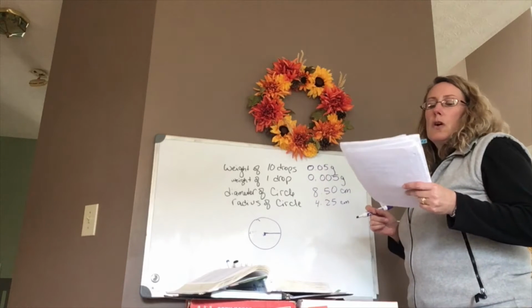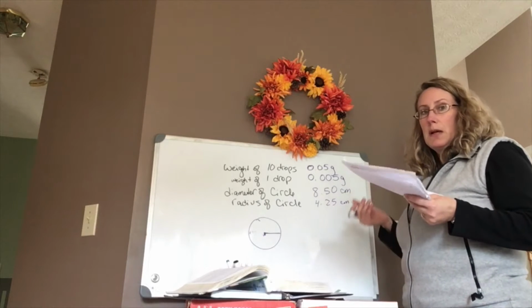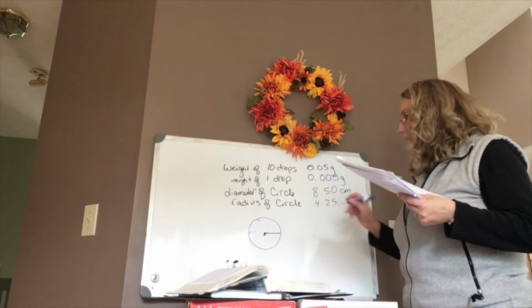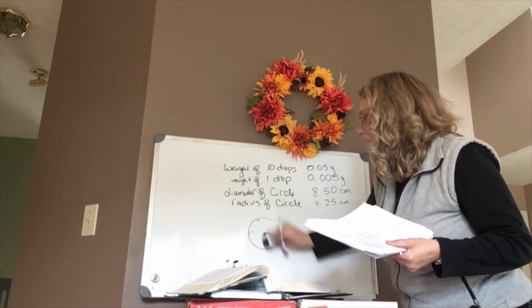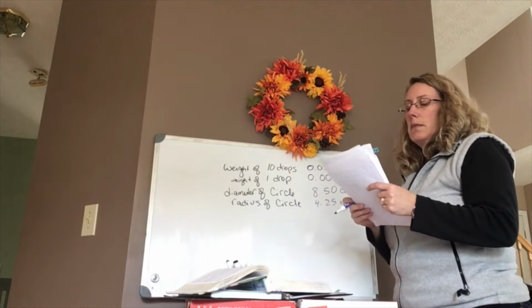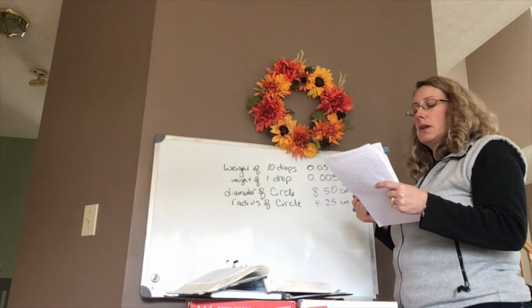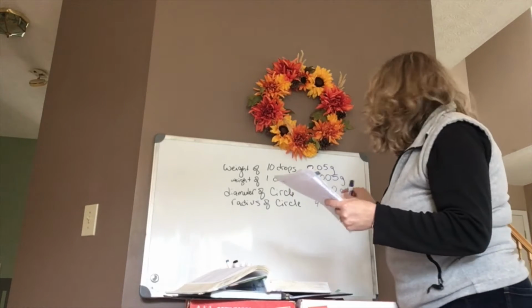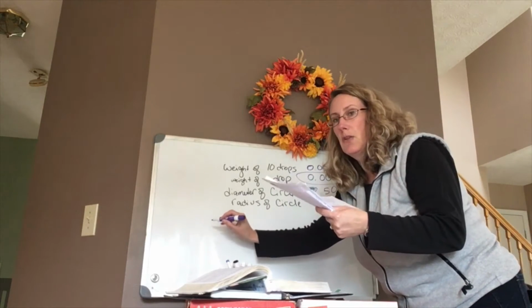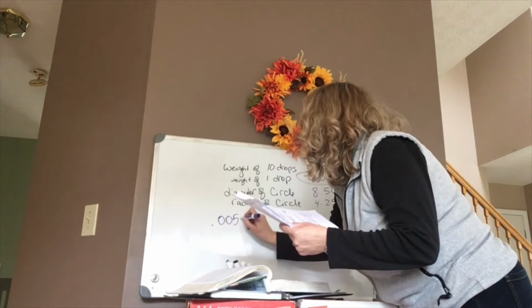Okay, so now we have done in the past how to measure the weight of a molecule. So you have to know what your molecule is. Hopefully you can see on your page a stearate molecule, which is what we're using. Oh, actually we skipped the calculation there. So then you take your weight of one drop, that should be the first line there, that's blank. So this one was 0.005 grams.